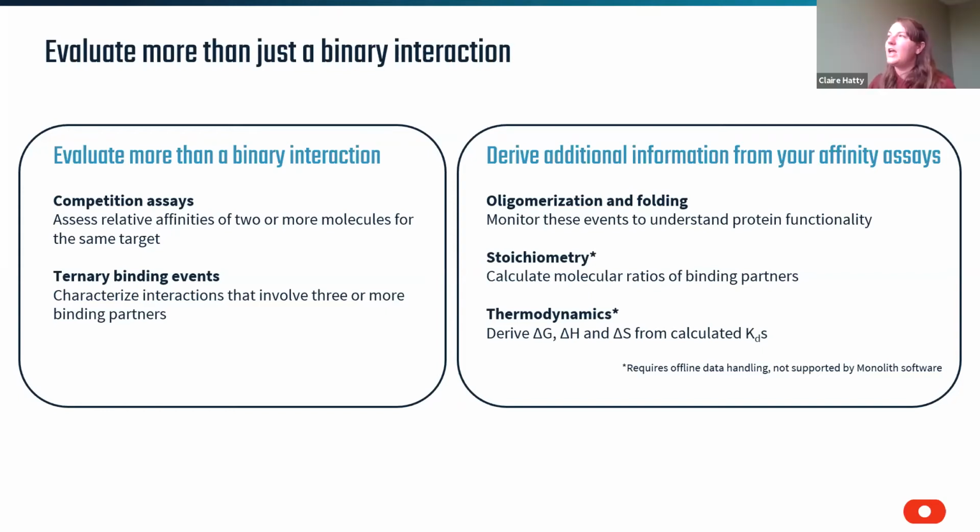So it can be that the KD does change. So we aim for the least put into the system. We aim to change the system as little as possible. We have different powers that we can use of the IR laser, which give different rates. So with some experiments, you could have only a very small temperature increase over the whole 20 seconds. Or you could even, in most cases, be able to see an interaction at 2 seconds where you've hardly had any heat change.